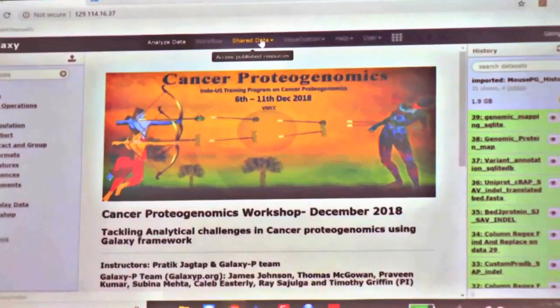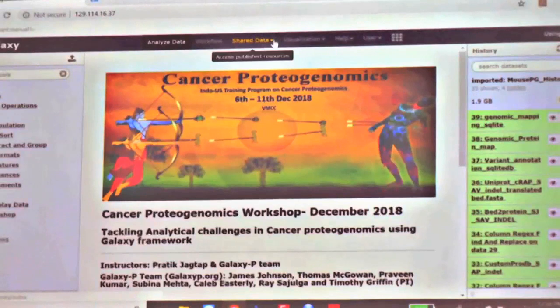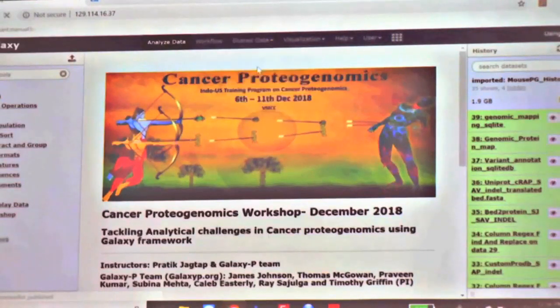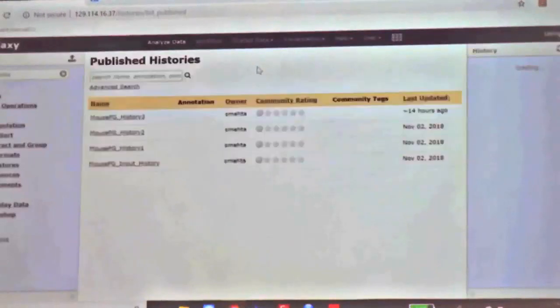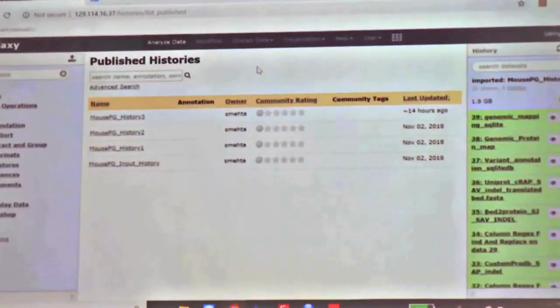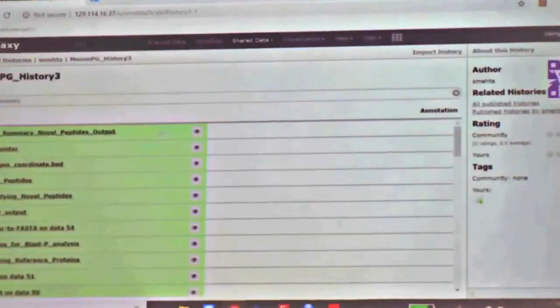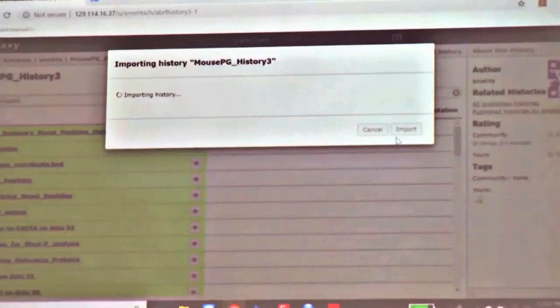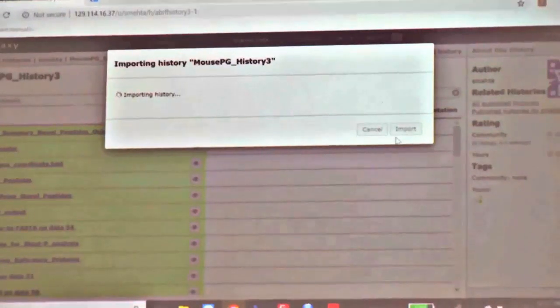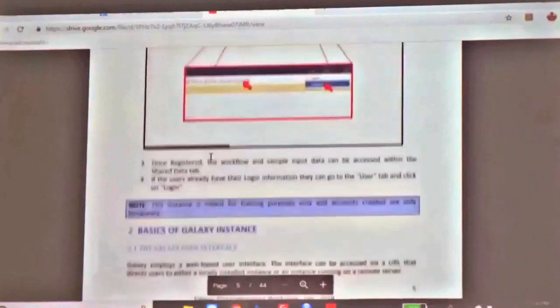Coming back — we searched the database and generated outputs. What I will show you is the last output that is generated, which combines everything: input files, output from the first workflow, second workflow, and third workflow. Galaxy has been in use in genomics studies for quite a few years now. We are basically adapting it and using its strength in genomics and transcriptomics for proteogenomics, because then it is easier to merge these. You can go through this in a step-by-step manner.